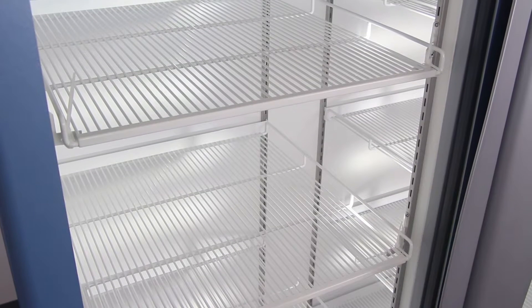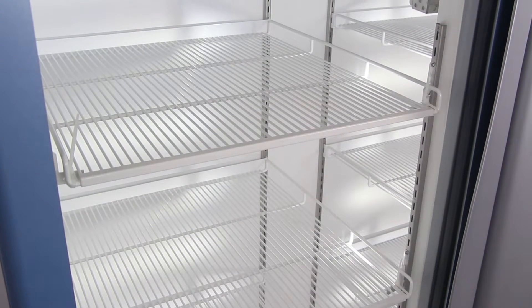Sturdy shelving provides storage space for the products inside. You'll also notice the recessed floor, which contains any spills that might occur for easy clean-up.